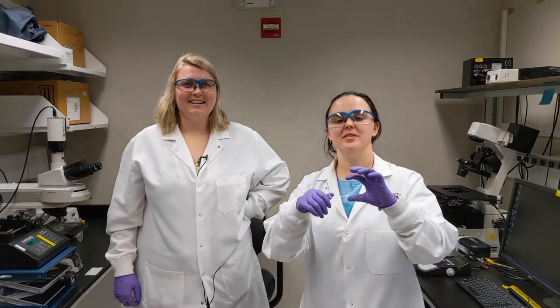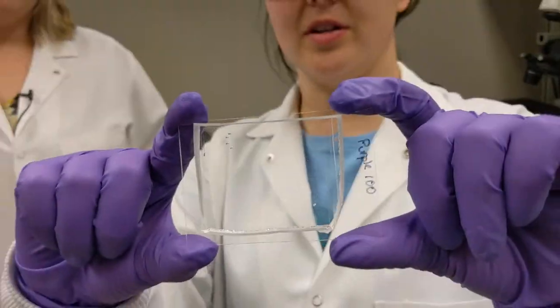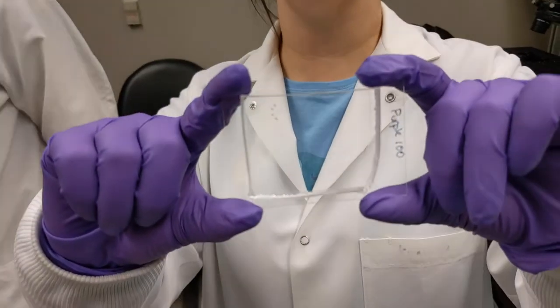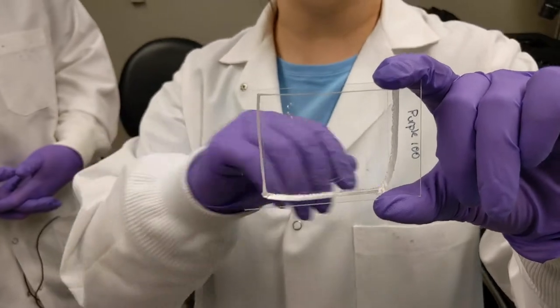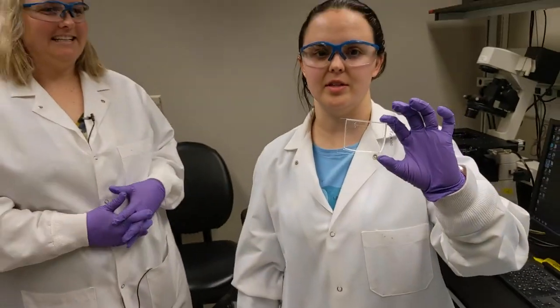So this is the Labyrinth. It's one of the microfluidic devices we use to isolate cells. It uses inertial microfluidics to isolate particles by size. So cancer cells are slightly larger than the other blood components, so they focus to a different spot, and we can collect them out of a different outlet than other cells in the blood.